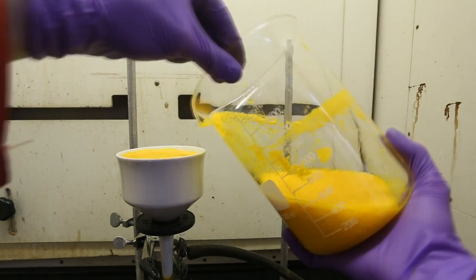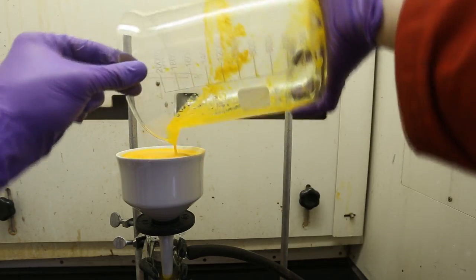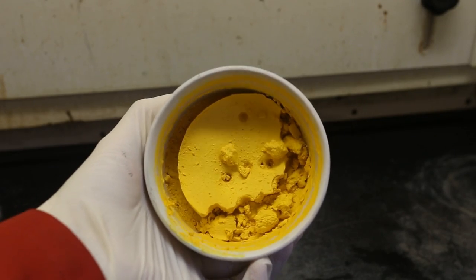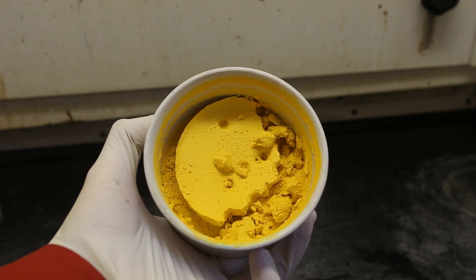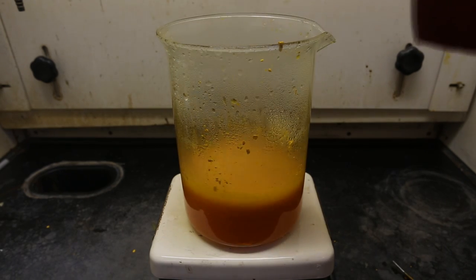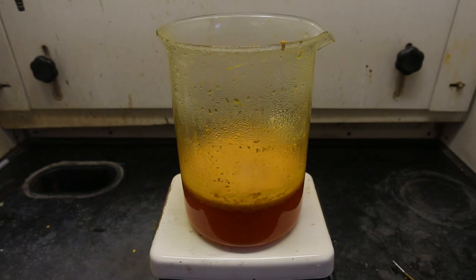I don't show it here, but I was sure to wash the beaker several times to remove as much product as possible. Next, wash your product with about 100 milliliters of cold water. And this is what my final crude product looked like. At this point, if you choose to recrystallize, you can use water or ethanol. For demonstration purposes, I will recrystallize the product in both water and ethanol. If you choose to recrystallize with water, it will require about 30 milliliters per gram of product at a minimum.